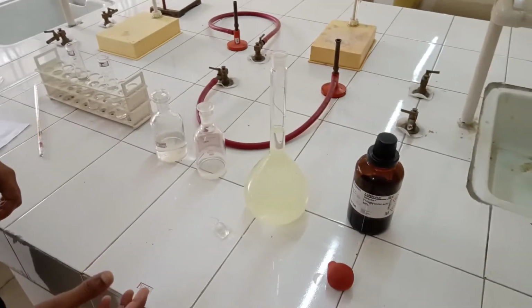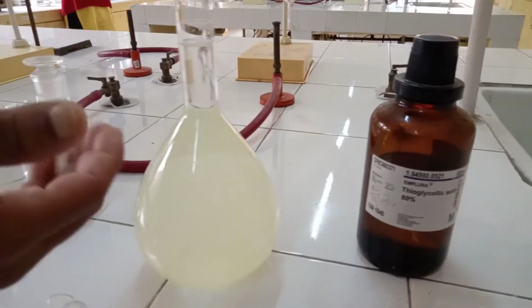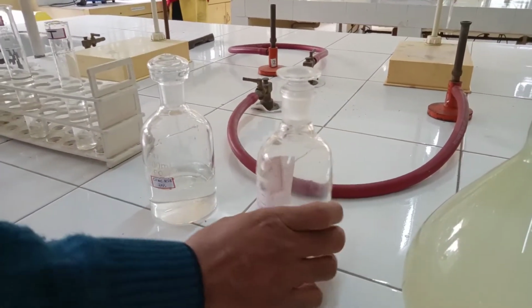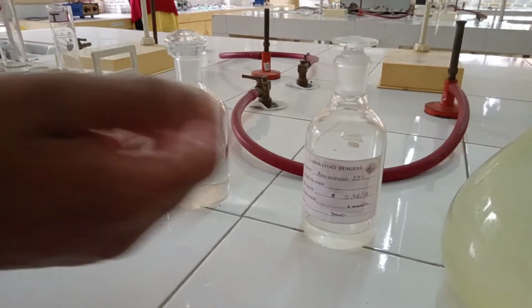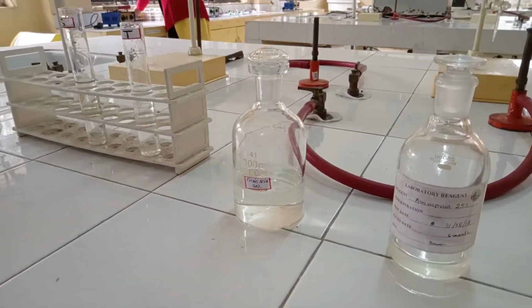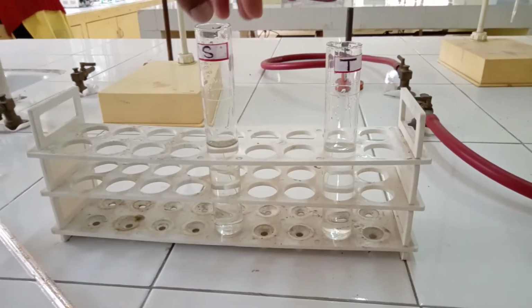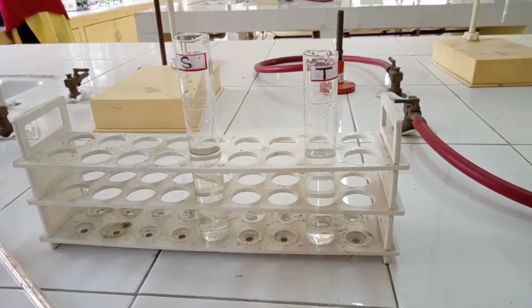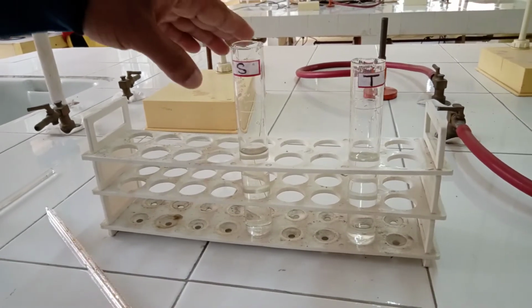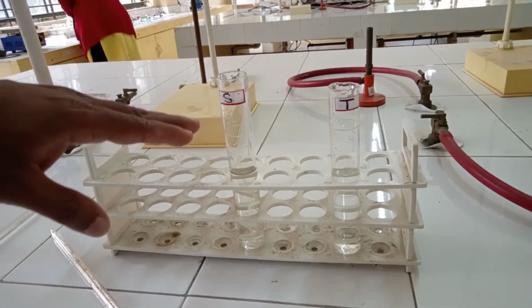So continuing with the experiment, you can see here we have taken thioglycolic acid, and this is the standard iron solution 20 ppm that we have prepared, and this is the ammonia solution that is required for the formation of the precipitate, and this is citric acid which is also required for the formation of the complex. And here we have marked 2 Nessler's cylinders as standard and test, and in the test we have taken 1 gram of sodium chloride and dissolved it in distilled water and made up the volume to 40 ml. And in case of standard, we have taken 2 ml of standard iron solution 20 ppm and dissolved it in distilled water and made up the volume up to 40 ml.